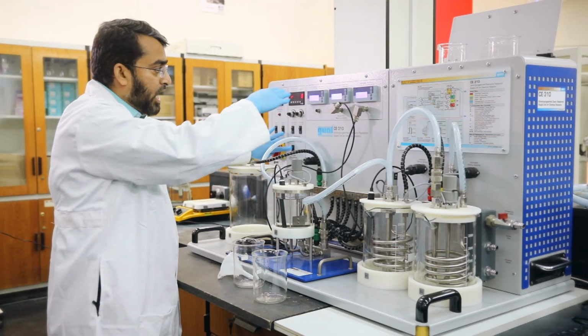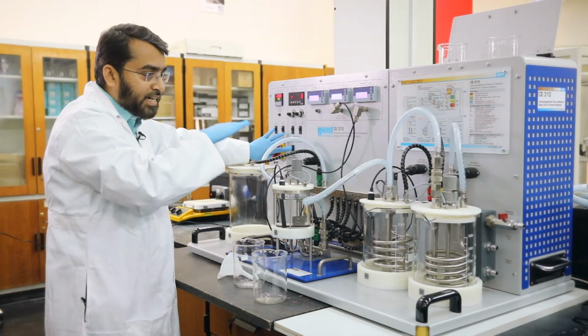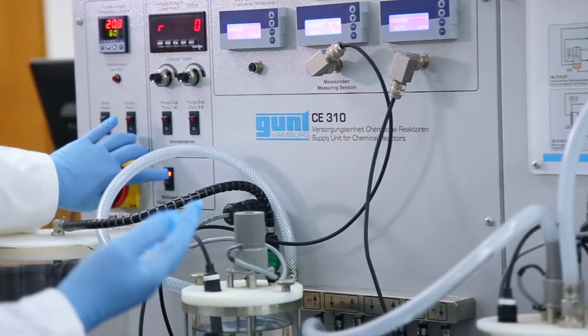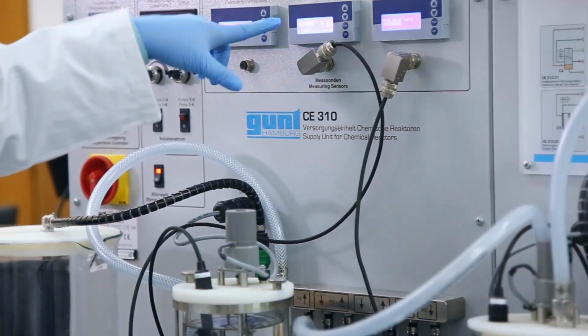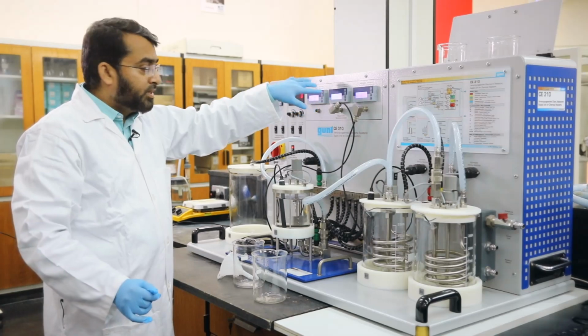After the conductivity reaches half of the previous value, you can say that this is the time t equals 0 where the reaction started. So now we can see almost half of the previous value. The reaction has started, and conductivity is decreasing with time.